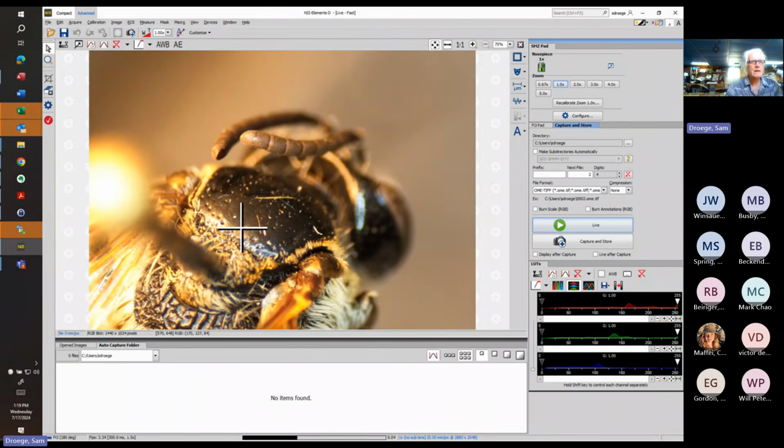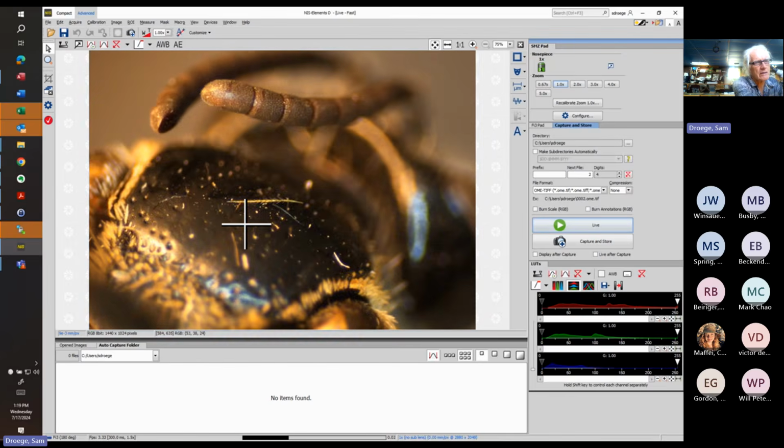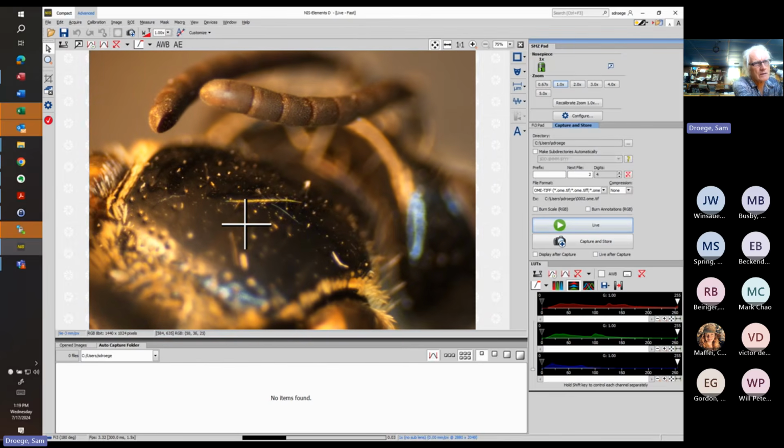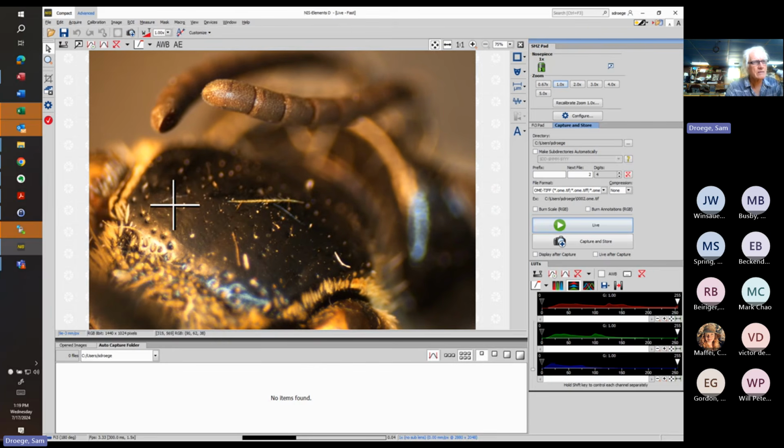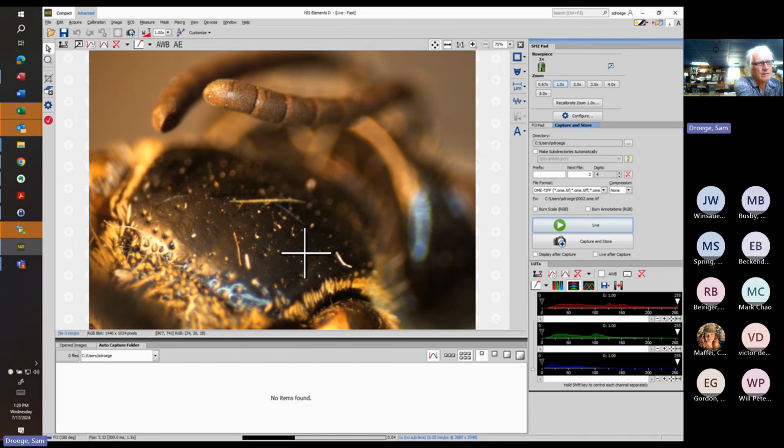It's a little bit of an oblique shot here, but it is super easy to see. We'll bring the power up here. There is some dirt on here, but even with the dirt, it's pretty darn clear. This is an old specimen. Pretty darn clear that these pits, there's just really a few here and there, and mostly the surface is smooth and unblemished by pitting. So very easy to tell from that point of view.